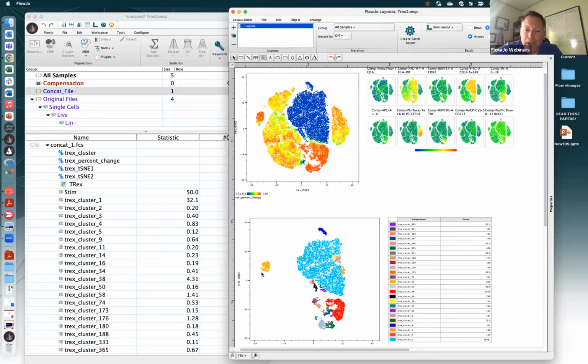So anyway, the clusters here I just dropped into an overlay, and you can see highlighting the ones that have mostly cells from one or the other treatment. So this big blue island here is that light blue one. You get a separate cluster as the thing that sticks out here, a few different smaller clusters for this group that were overexpressed in the more stimulated file, and then one more over here in the more stimulated. Ignoring all of this, which had cell representation from both stim and unstim, so it isn't really super interesting for differentiating qualities.